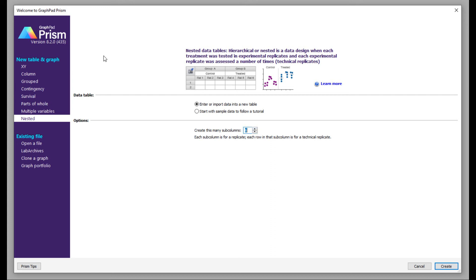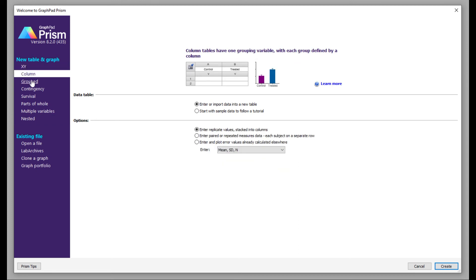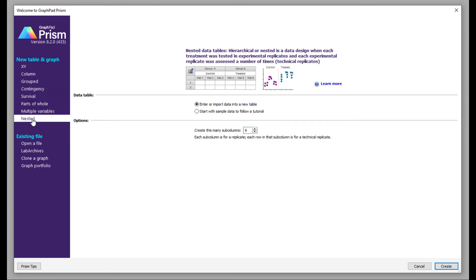In this series I'm going to show you how to plot XY, column, group, contingency, survival, parts of whole, multiple variable, and nested plots using simple datasets for all these options available in Prism. This will be really helpful if you are starting your PhD or want to go into research — this will be the starting point for you to plot your data. I will provide a link where to download this software; I am using a licensed version so you might have to buy a license. I would suggest you download the latest version.